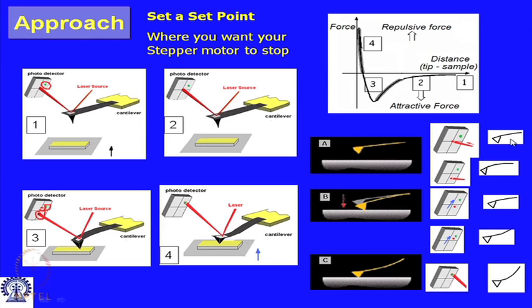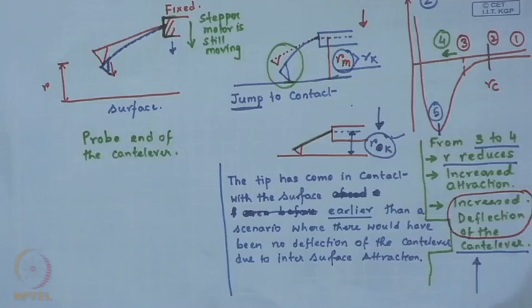So, these also capture the configuration of the nature of the deflection on the cantilever, as well as how the laser spot moves on the QPD. So, this is at the aligned position, this is when it is subject to attraction, it shifts in this direction. This is beyond jump to contact, it is now traversing back following the same path, some of the figures we had drawn.